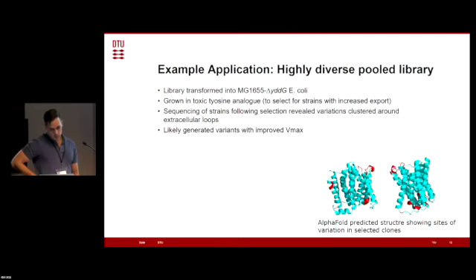So we have these sequences, and the other nice thing about Speedy Genes is once you have your oligos, you have them. So we can iterate quite easily. If we know these are the regions that we're interested in, based on this first selection, we can lock down everything else by using the wild type sequence for everything that wasn't showing up as enriched, and then focus on just using the degenerate codons at these regions. And we can even go back and do more specific subsets of these degenerate codons again.